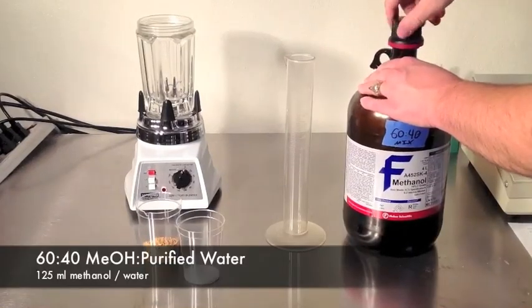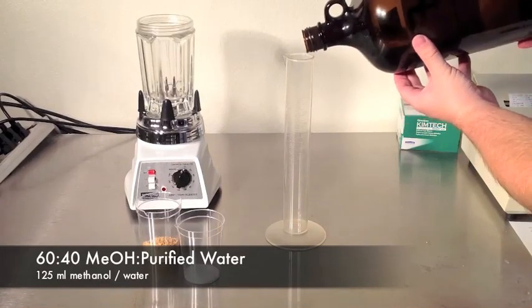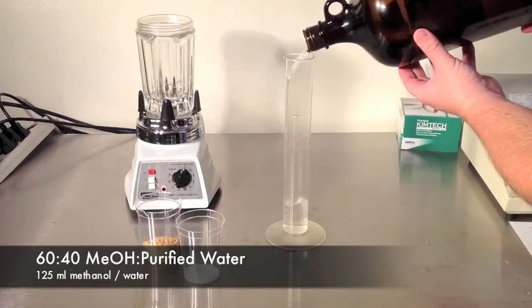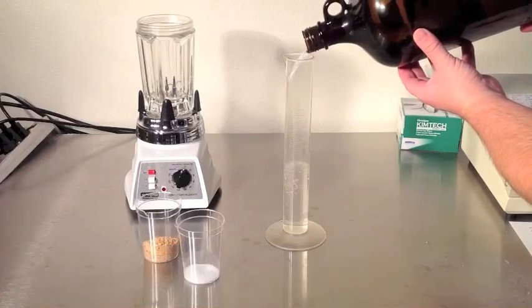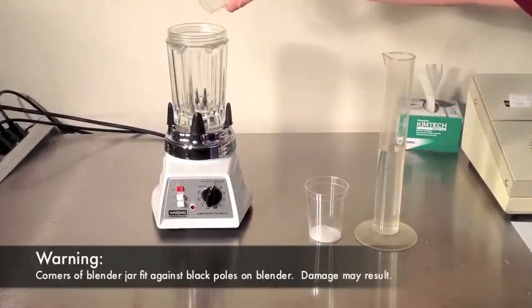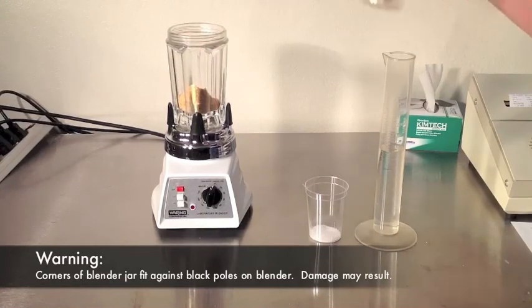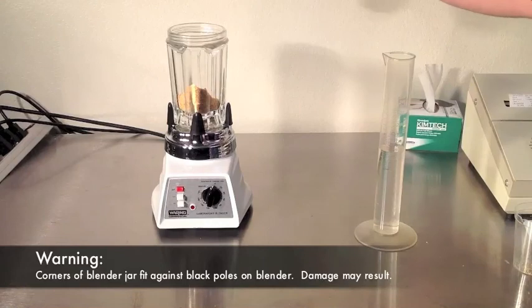Measure 125 milliliters of 60-40 methanol and purified water. Add the sample, salt, and methanol to the blender jar. Set the timer just past 60 seconds and blend on high.